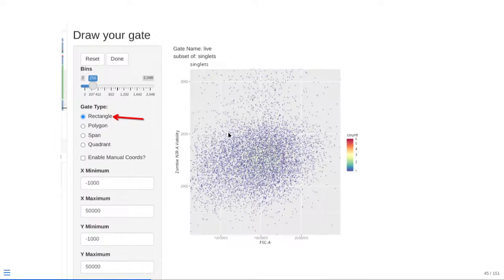In terms of actually visualizing this plot, you can see it's doing something very similar to what Cyto did, where it zoomed in on all the dots that are present, not based off of the coordinates you provided, like Cartesian, to be able to zoom out and view the whole picture. So this is just one caveat when you're viewing these plots. If you've subsetted down and you're just looking at your CD8 T cells, it'll look like a uniform blob for CD8. You won't be able to see the white space where you would expect to see your CD4. So just a general caution: the ggcyto plots will zoom in on the dots that it has available.